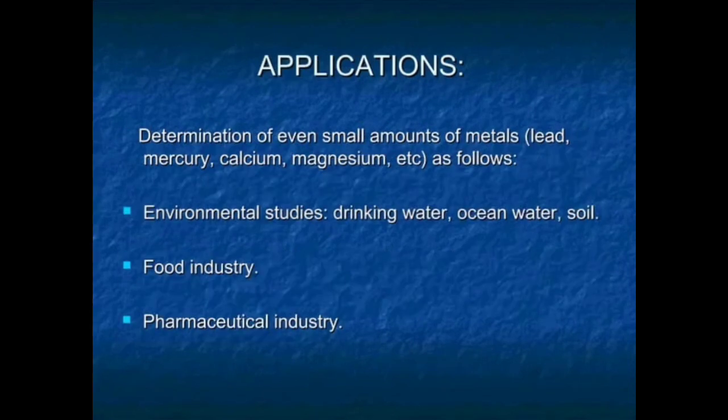Applications of atomic absorption spectroscopy are determination of even small amounts of metals like lead, mercury, calcium, magnesium, etc., as follows: environmental studies, drinking water, ocean water, soil, food industry, pharmaceutical industry.